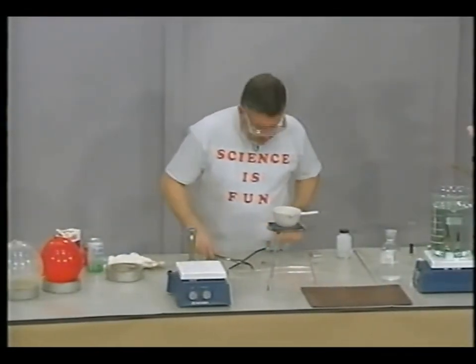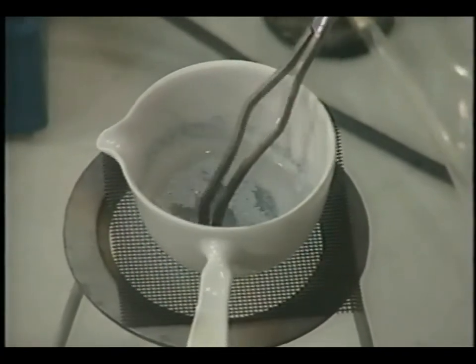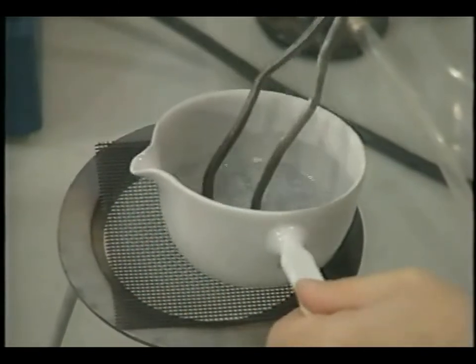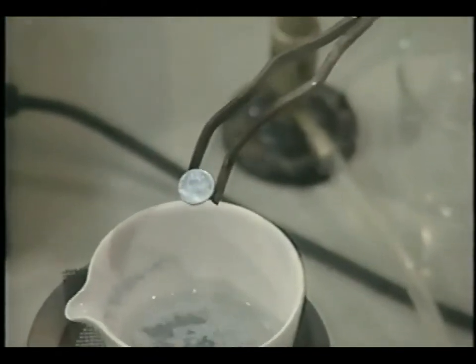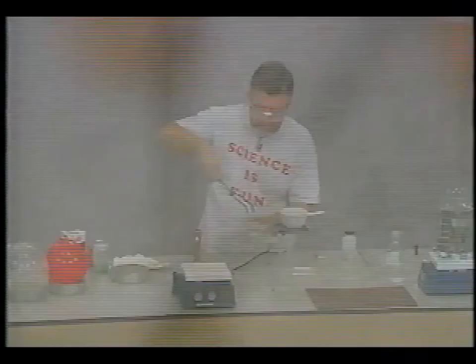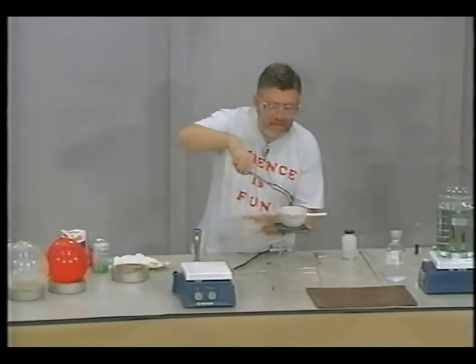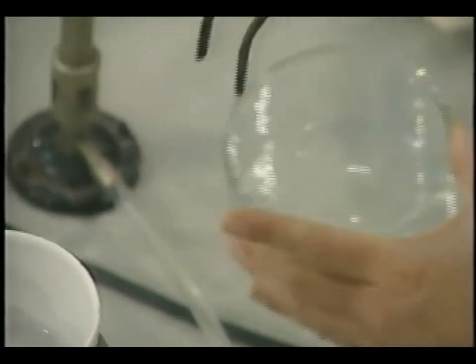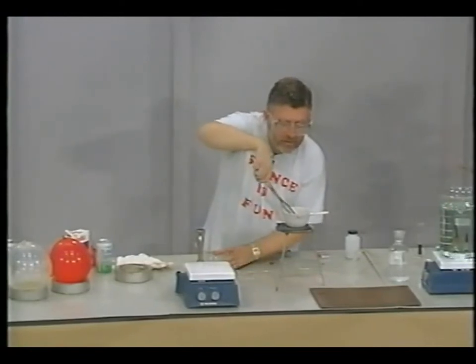And we look now into the... Let's see what we have here. Here's the first penny that I dish out. And you see that it's no longer a copper penny, right? It looks silvery. So maybe what we've done here is achieve part of the alchemist's dream, right? Of changing copper to silver. And we'll see if we can change it to something else.